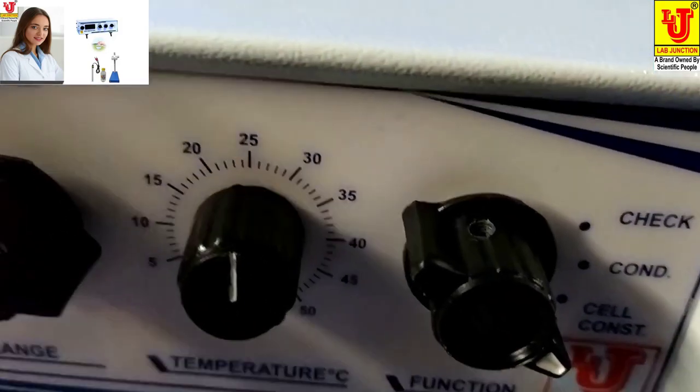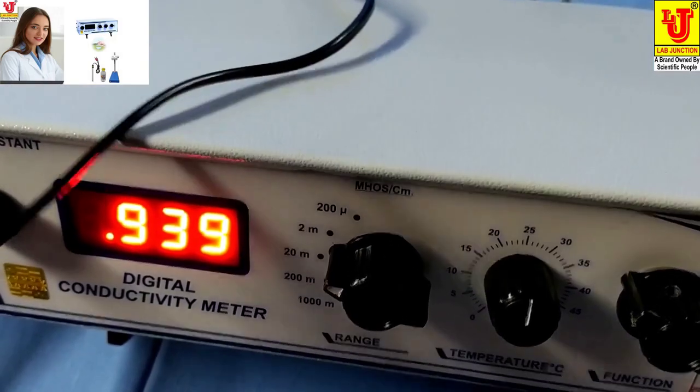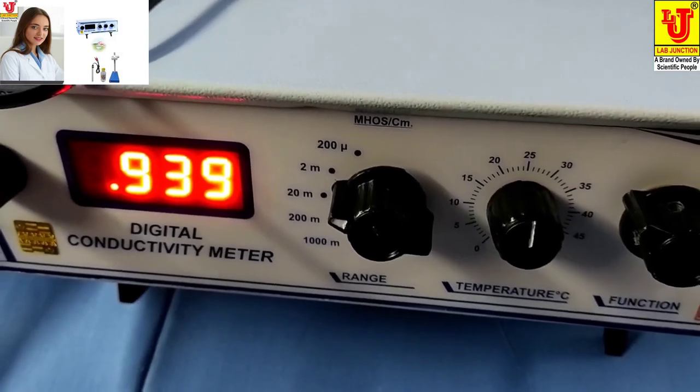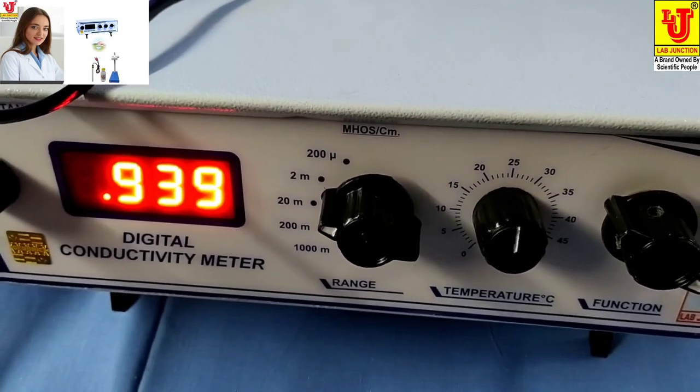Your cell constant is now, suppose, 939. You can note it on your notebook.